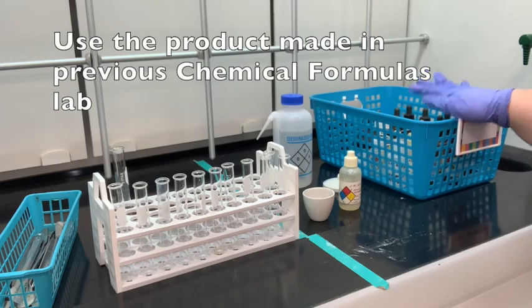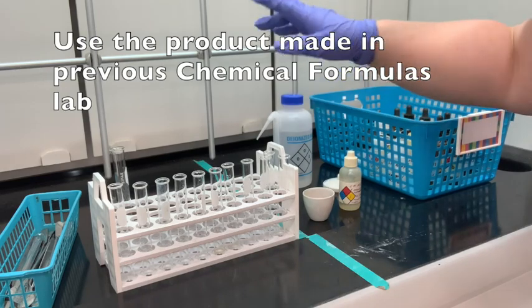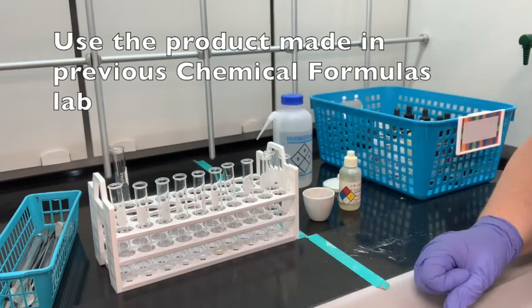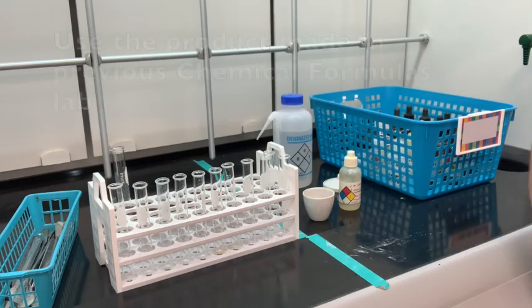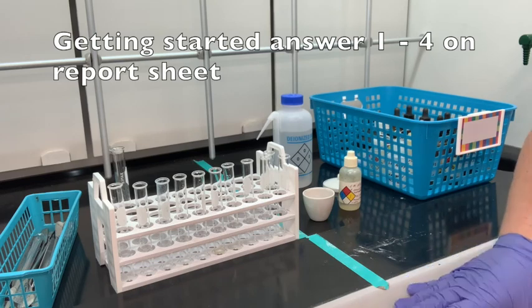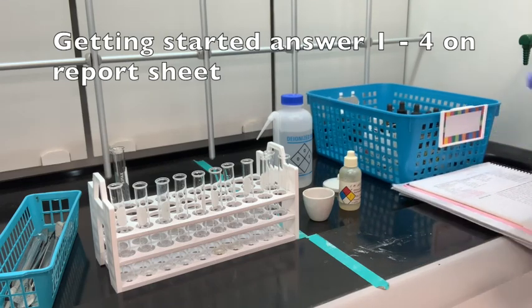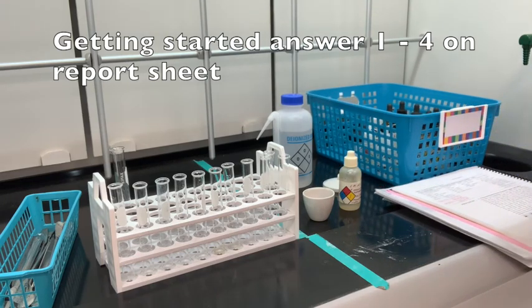I have all my chemicals over here. I have some distilled water and spatulas. Should have everything I need to do all these reactions. So we're going to get started. You want to follow along with the book, the chemical reactions. I'm going to stick my book up here so I can go through it.